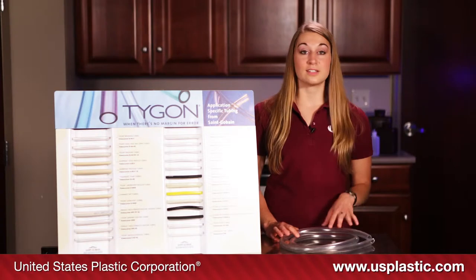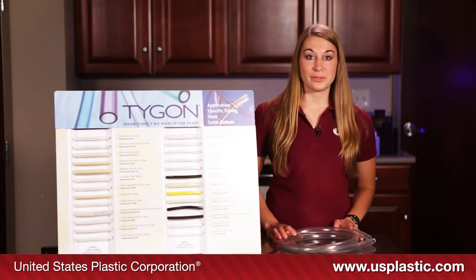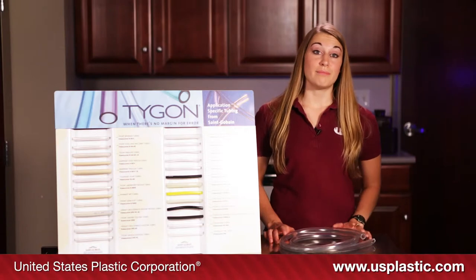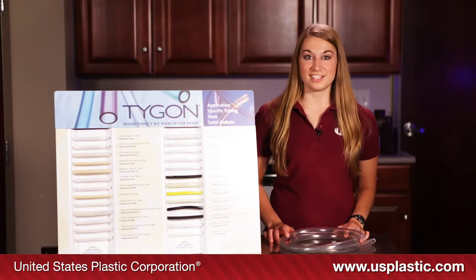This tubing is compatible with many different chemicals and cleaning agents. It is non-toxic and can be sterilized using conventional autoclave methods. It is approved for use with food and beverages in the United States and several other countries.